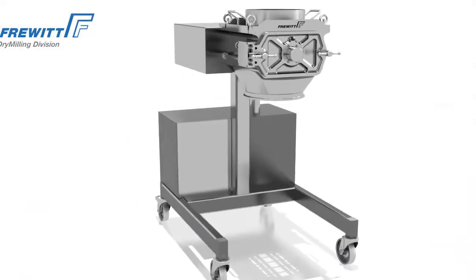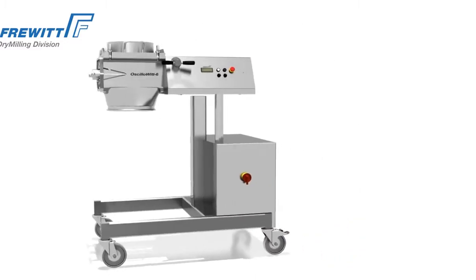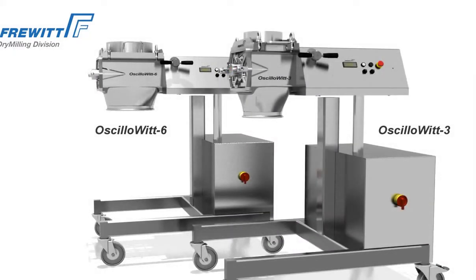The patented sieve mills of the Osillowit series are especially well suited for narrow grain size ranges without fine particle generation, and they are available in the Osillowit 3 and Osillowit 6 sizes.